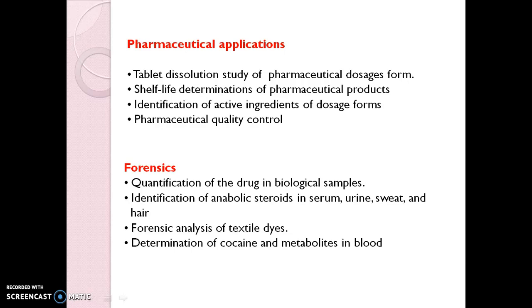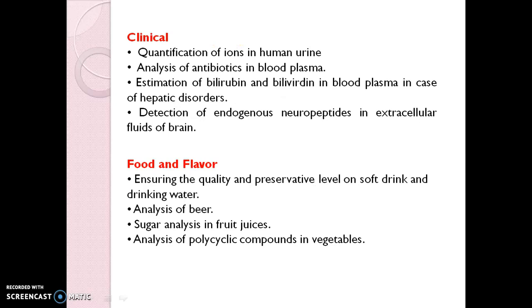Now in the forensic field or forensic study: quantification of drug in biological samples, identification of anabolic steroid in serum, urine, sweat and hair, forensic analysis of textile dyes, determination of cocaine and metabolite in blood. Here we have listed a few applications; lots of applications are there.